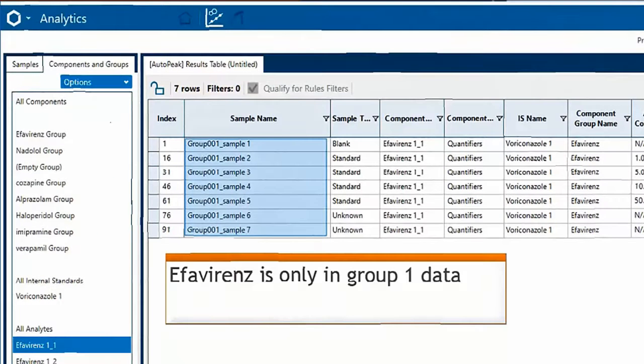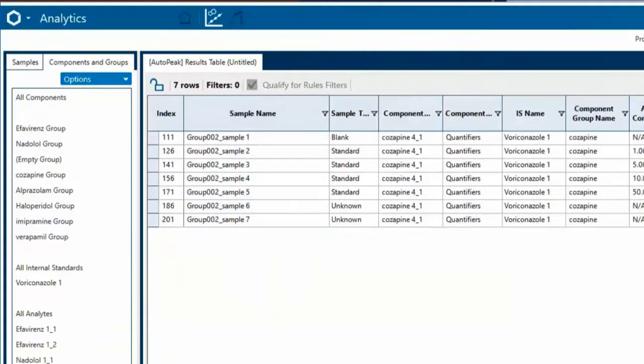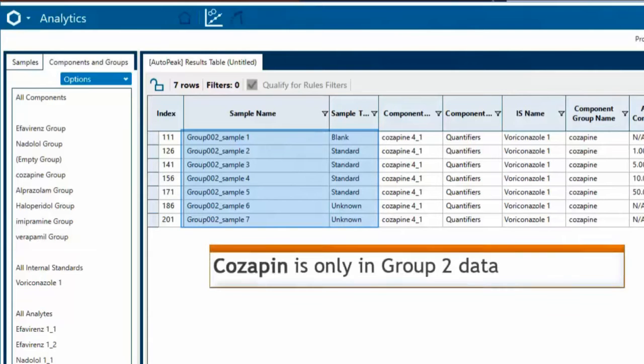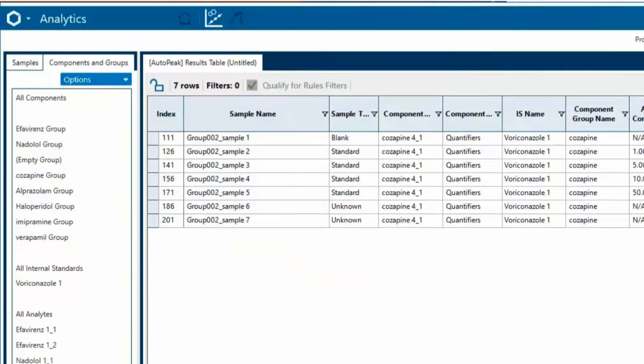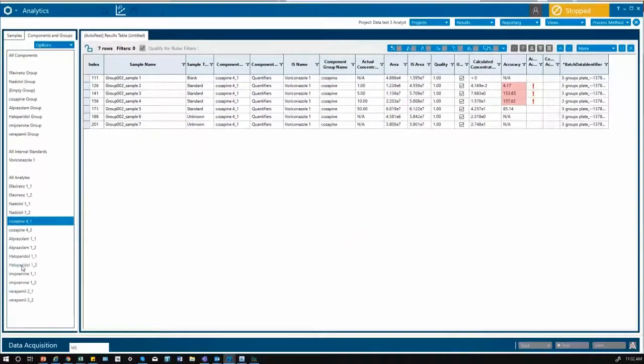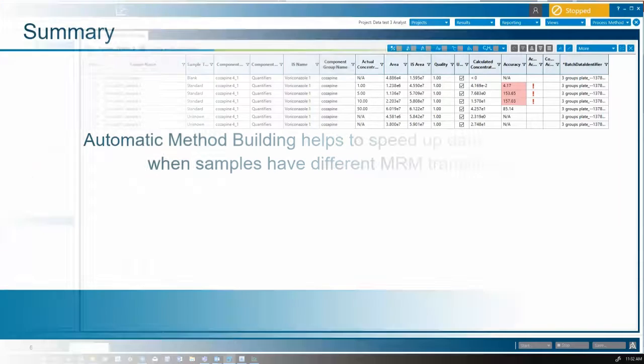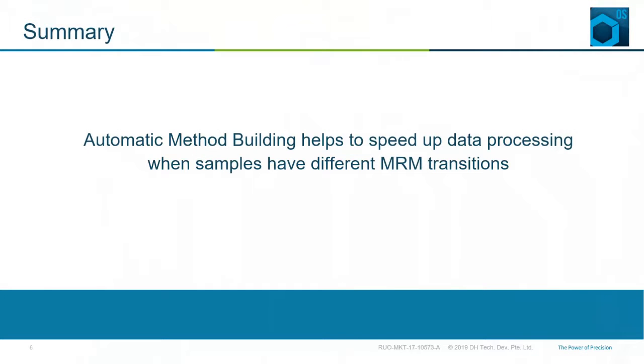You can see here that efavirenz is only in group 1 data and cosapin is only in group 2 data, but both are included in the one method. In conclusion, automatic method building helps to speed up data processing when samples have different MRM transitions.